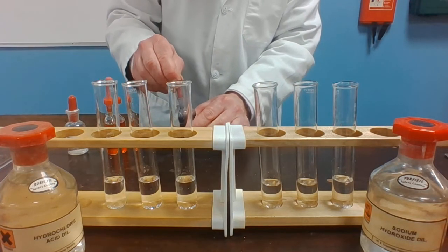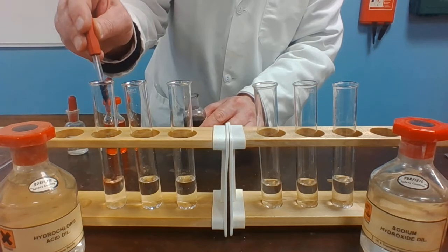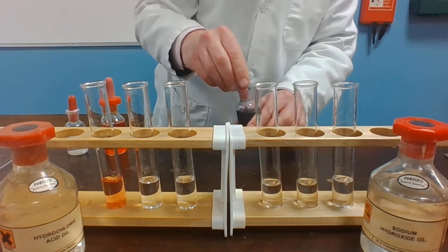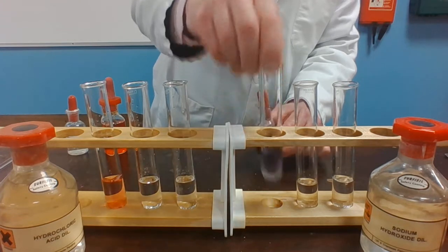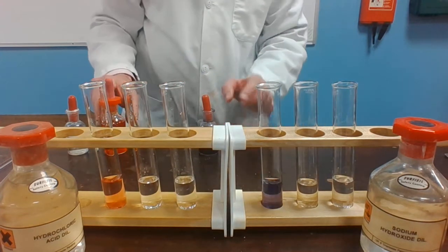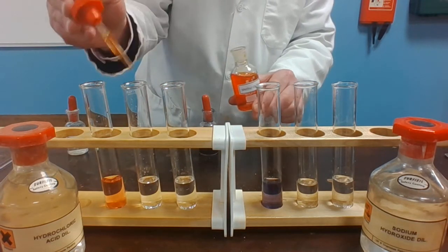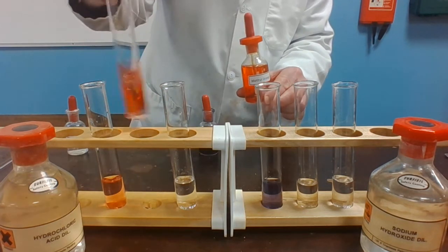First of all, we'll test them with litmus solution. Adding litmus solution to the hydrochloric acid and it turns red. Add it to the sodium hydroxide and it remains a sort of bluey-purple color.